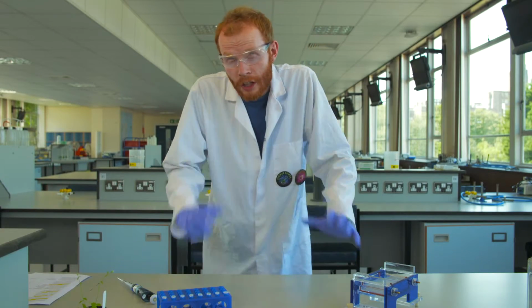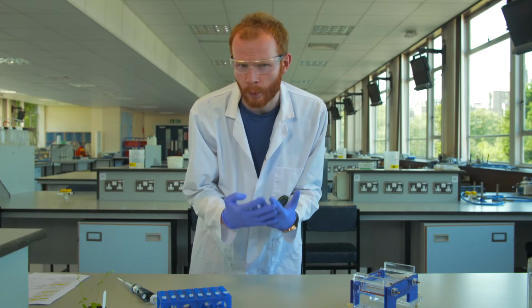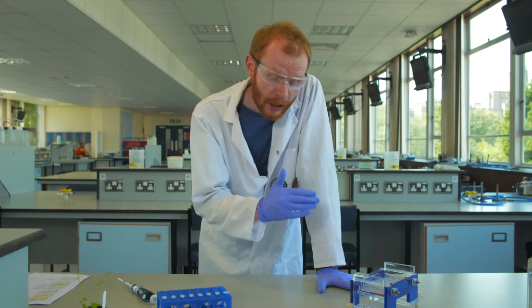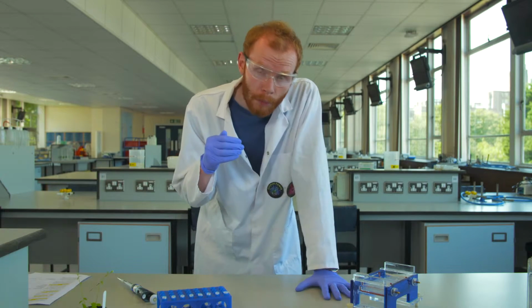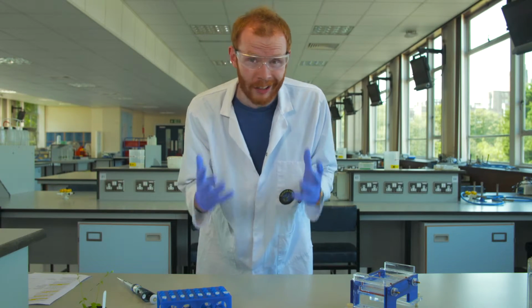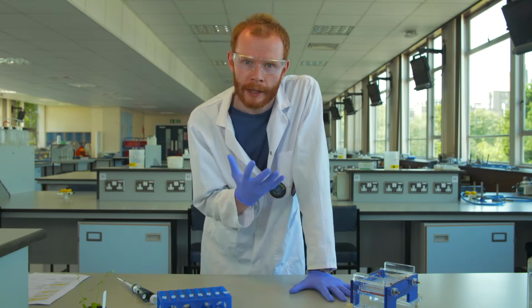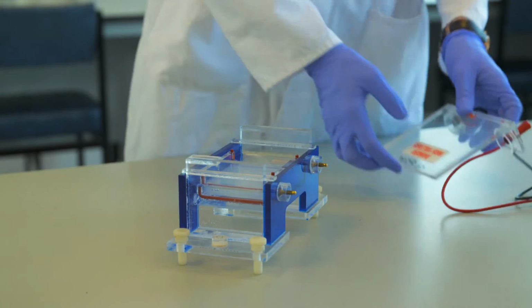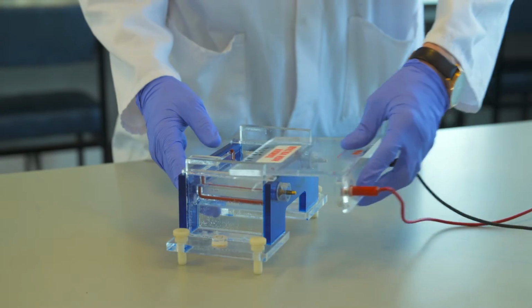The gel is essentially formed from a tiny meshwork of cross-linked polymers which act as a molecular sieve. As such, the smaller molecules will move more quickly through the gel, whilst the larger molecules will get caught up in that mesh and travel more slowly. The gel also contains a special stain so that when we finish with our electrophoresis, we can visualize our DNA under ultraviolet light.